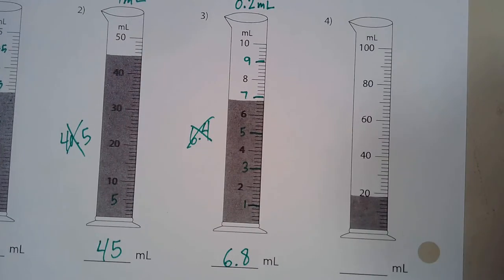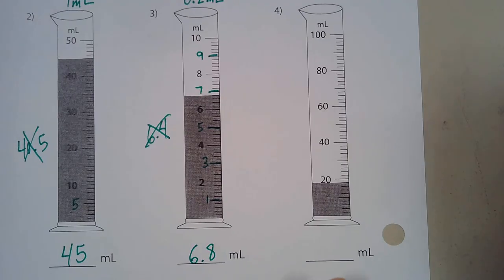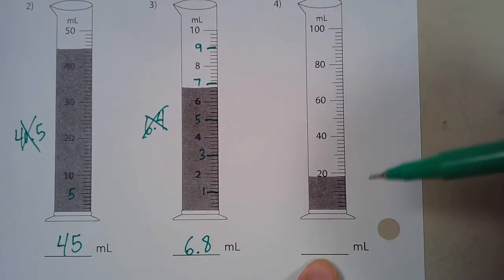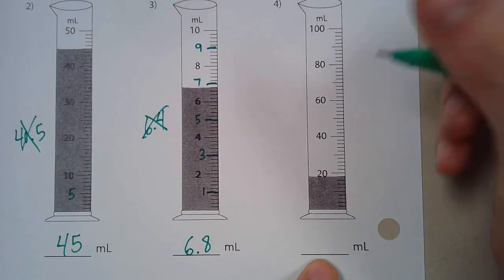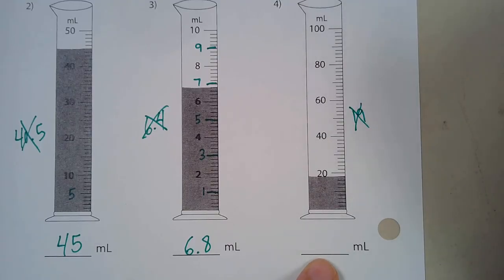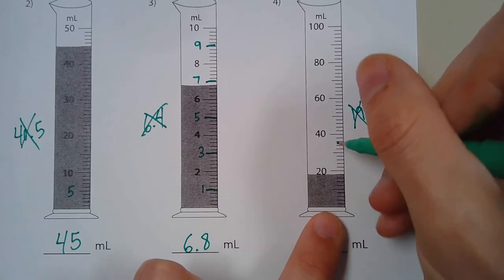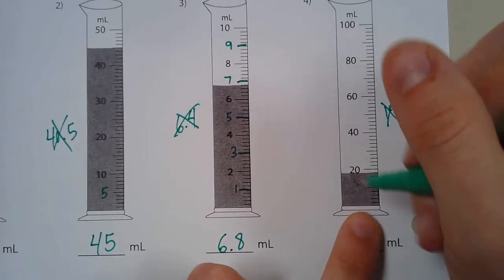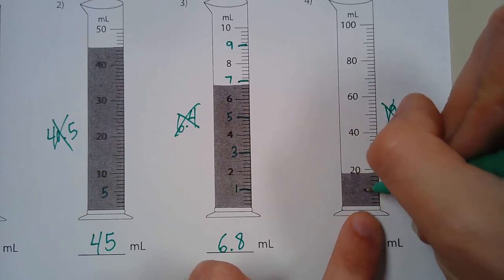Now I'll do one more example for you guys. This one. I have some students that look at this and they say, well, it's just one line below 20, so it must be 19. But it's not 19. So same thing as the other ones, figure out what our scale is. So here between 0 and 20 would be 10. And we have five lines between 0 and 10.